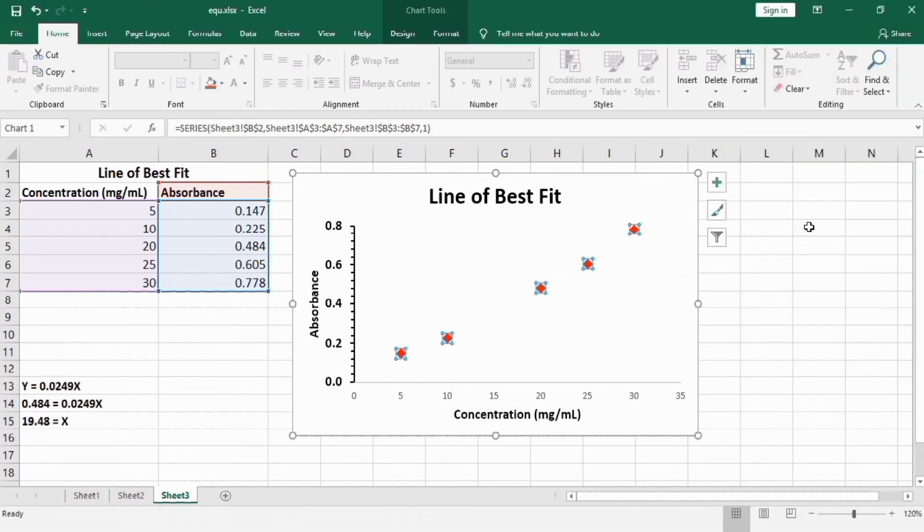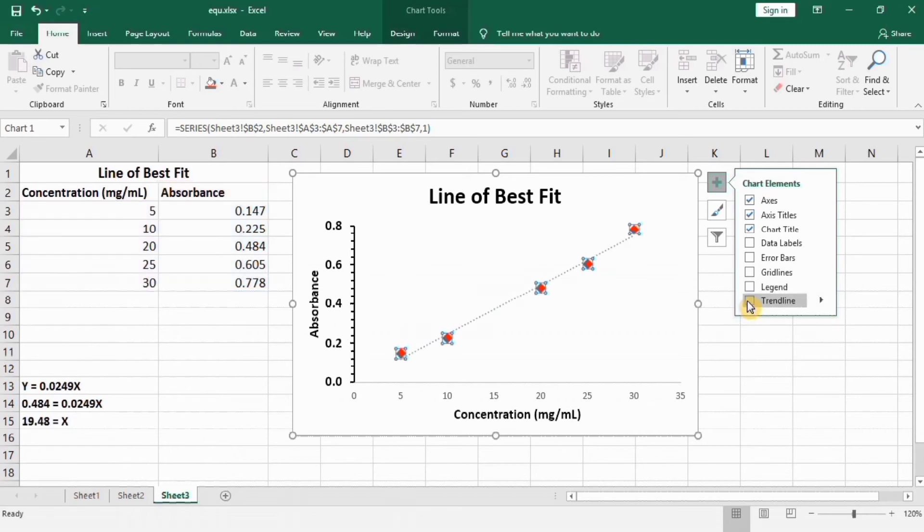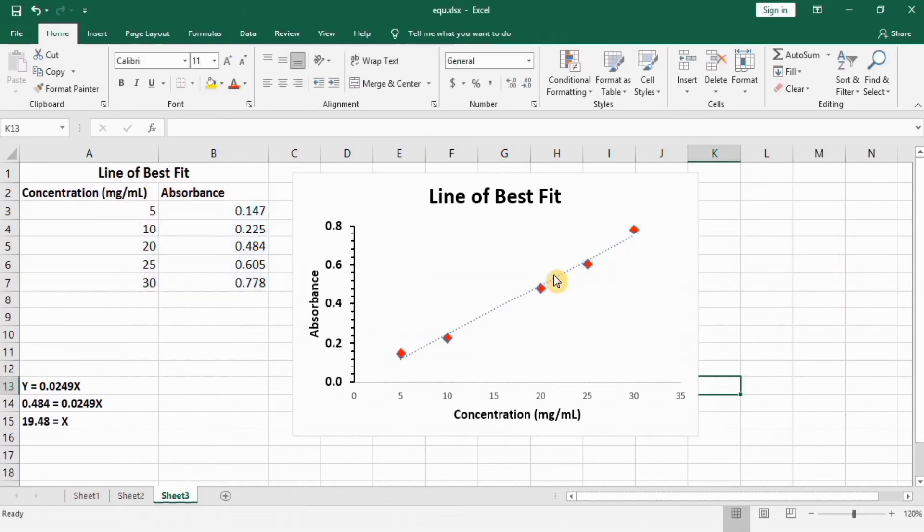Now if you want to insert trend line, go to this plus sign, add chart element option, and check this trend line option. Now you can see here Excel has generated a trend line. Select this one.